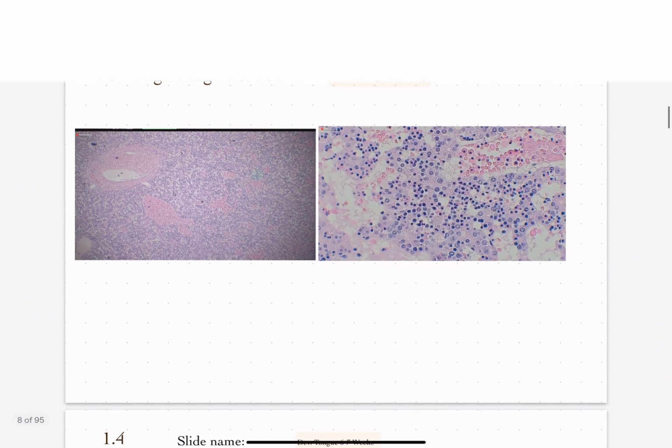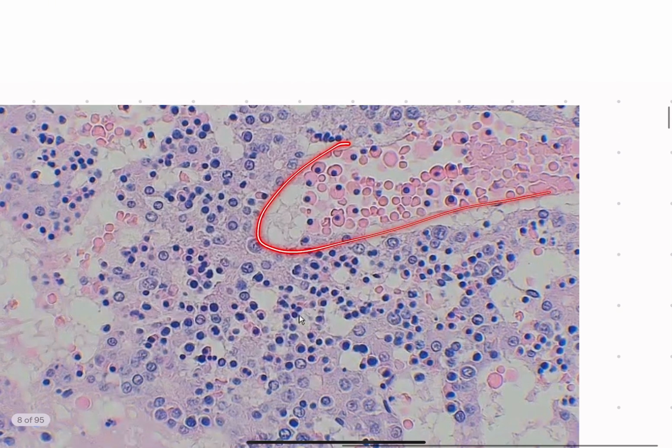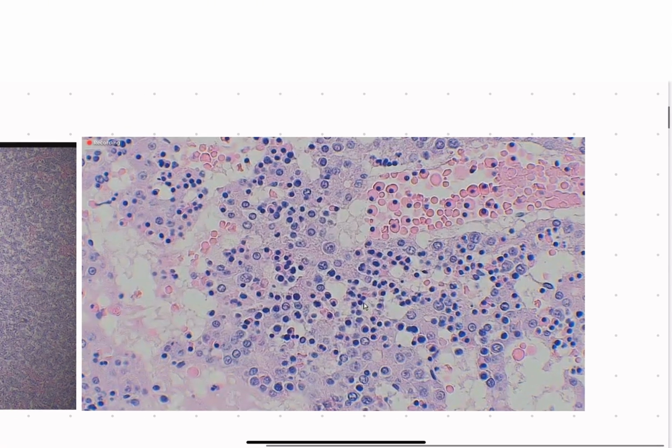Same slide and same tissue that we're in. We're still in the liver. But instead of looking at the megakaryocyte, we're actually looking at this thing right here. And this is a blood vessel. A lot of the time, the professor likes to fool you or trick you into thinking that this is a more advanced structure that you've been studying for, or that you've recently learned about in this colloquium. But in reality, it's just a very common blood vessel. And they like to spice it up like that.